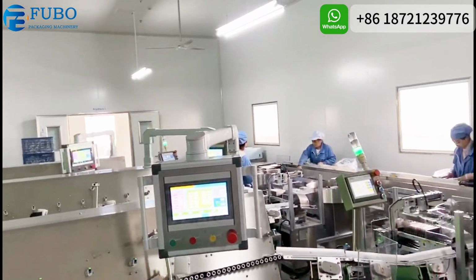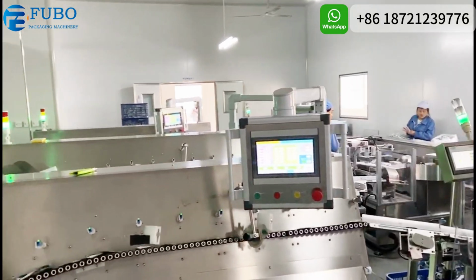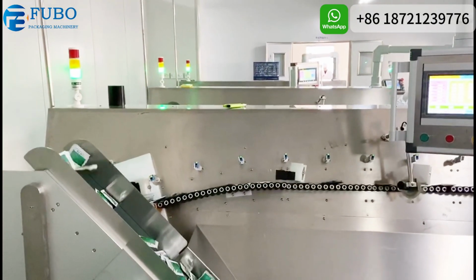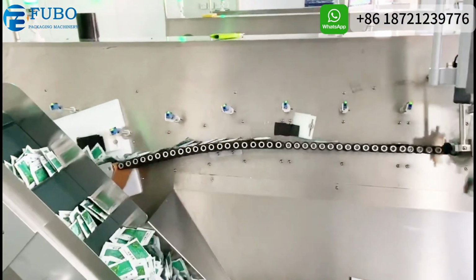Medicine bag assorting and counting machinery is widely distributed across various industries due to its essential role in packaging. Here's a breakdown of their functions. 1. Sorting, dispersion and orientation.